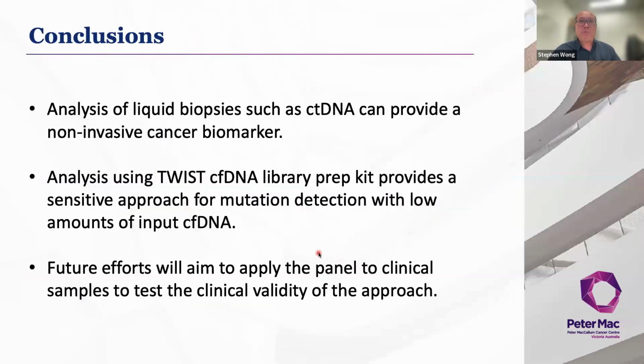So overall, I hope I've provided some basis around how we can utilize liquid biopsies such as ctDNA to provide a non-invasive cancer biomarker for various clinical applications, and how we can utilize Twist's cell-free DNA library prep kit to provide a sensitive approach for mutation detection, particularly with low amounts of DNA input. And our future efforts are now aiming to apply this panel to further clinical samples and test the clinical validity of our panel for future studies.